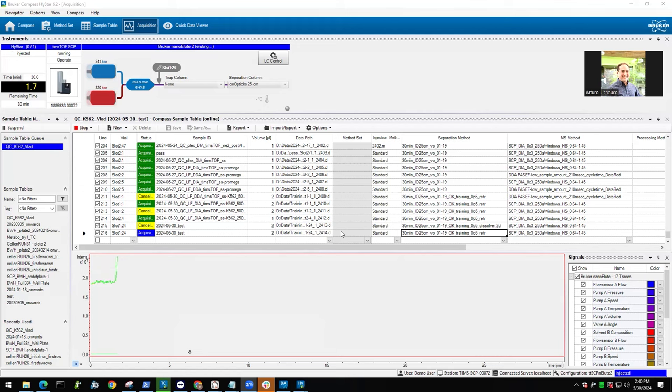And with the autosampler arm, you can actually do that. You take a certain volume from a certain vial in the wash position, where you specify the vial position. You take 1 microliter, 2 microliters, 5 microliters, whatever volume you want. You bring it to your sample vial, you dispense the solvent, let it sit for half a minute, let's say, and then you go in with your autosampler needle again. You take half of the sample, pipette it up, pipette it down a couple of times. I typically do it 5 times to make sure you redissolve everything in your sample, and then you take the entire sample and load it onto your column. So you can set it up. There are special dissolve methods for this. I can show you how that looks on the system. It would basically always redissolve your sample just before you start the analysis, which is quite helpful.